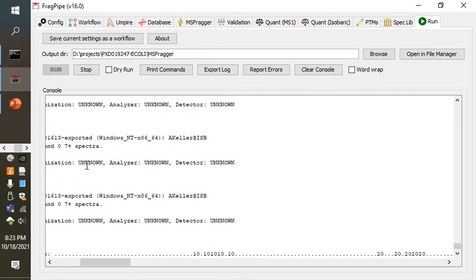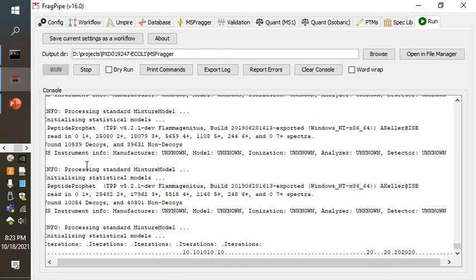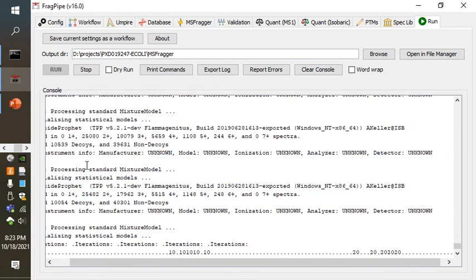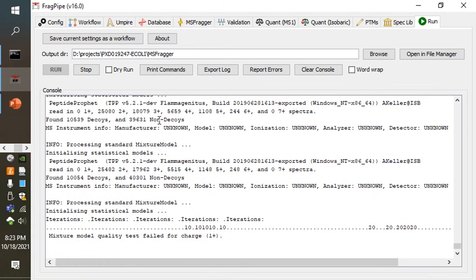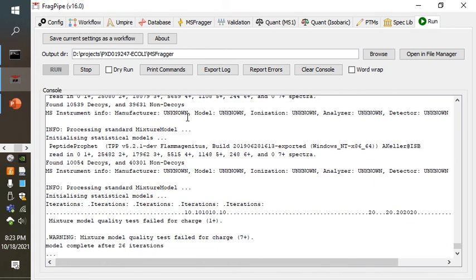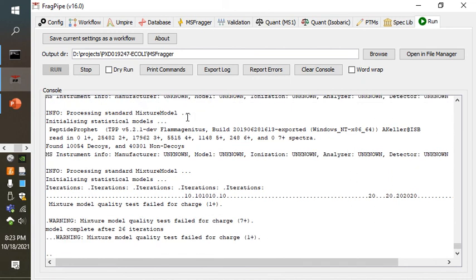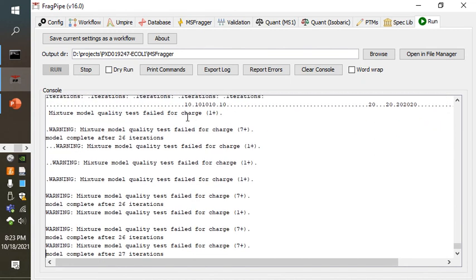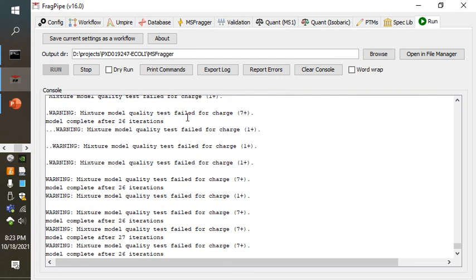And I want you to keep in mind that that represents the fact that the target matches, what it calls non-decoys up here, are a mix of PSMs that are falsely identified and PSMs that are correctly identified. The decoys are all falses.